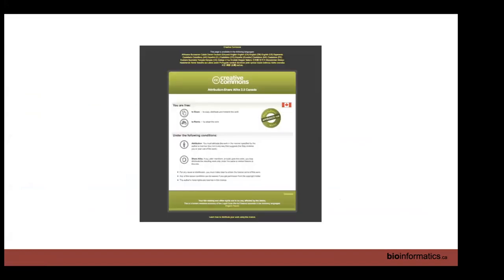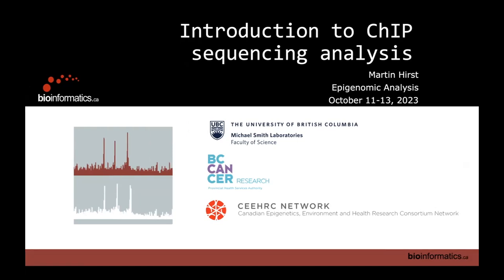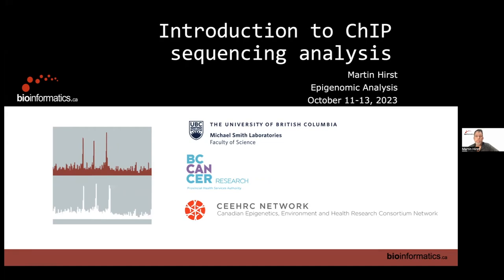All right. So I think we've already been through the license. I'll be teaching the next couple of modules in partnership with Edmund. And really the purpose of this first module is to frame the discussion that we're going to be having around ChIP sequencing analysis. And we've also this year spiked in a little bit of ATAC-seq, because in previous years, many students have been interested in learning a little bit about ATAC-seq. And as you'll see, the ATAC-seq workflow is almost nearly identical to the ChIP-seq, with the exception of some details that we'll get into around how you process the data. So with that, I'll get started.